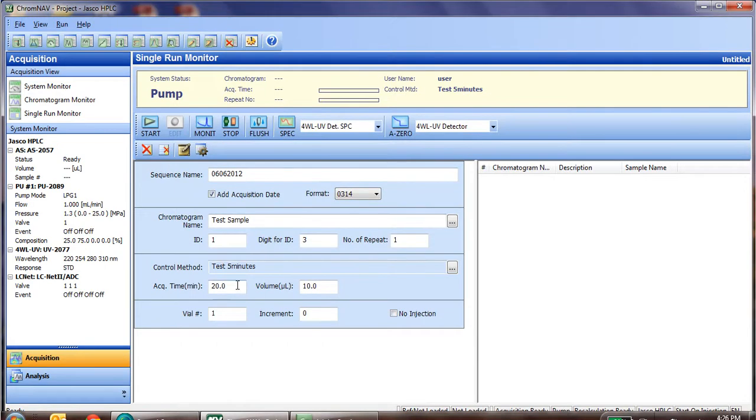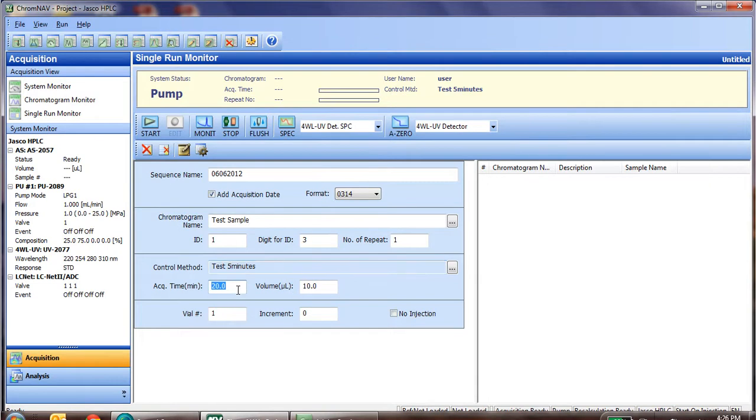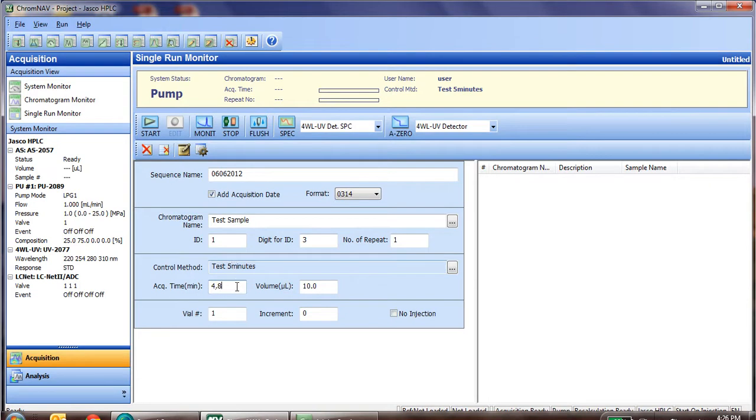The next step is to set the acquisition time. The acquisition time needs to be 0.2 minutes less than the control method. That 0.2 minutes allows the software to save and do any data analysis. So in this case, we'll put 4.8, as the method, as you can see, is five minutes long.